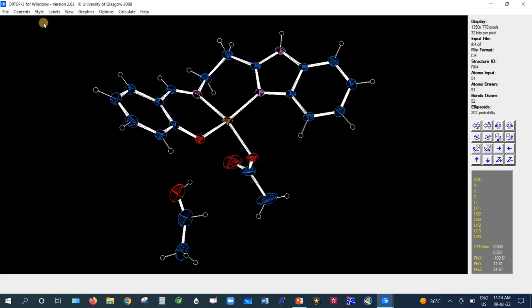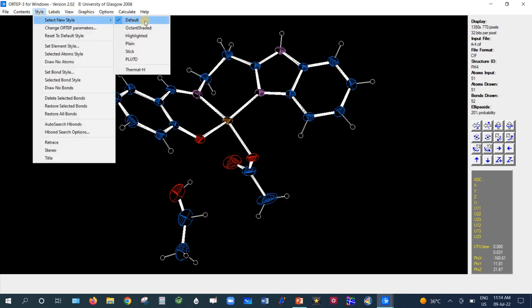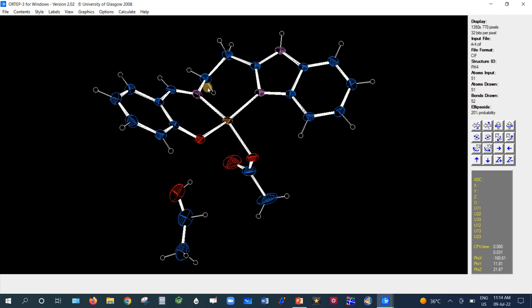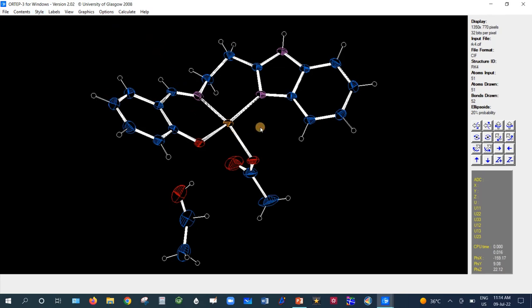There is also a Style menu option for octant shading. The available options include default, octant shaded, highlighted, plain stick, PLUTO, and thermal hydrogen. The most suitable option is octant shaded.